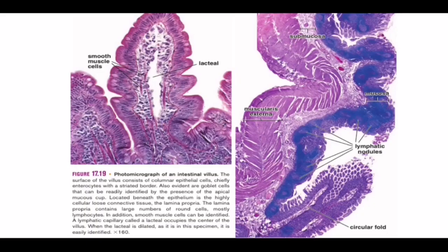All right. So remember we said that we have luminal folds in the small intestines. We have folds, the plicae circulares, and we also have folds on the plicae circulares. These are mucosal folds which will form what you call the villus. So this is a villus with a lamina propria core and a central lacteal in the center. Remember, we once said we can find smooth muscle fibers extending from the muscularis mucosa into the lamina propria. These smooth muscle fibers will facilitate the localized motion of the villi themselves.